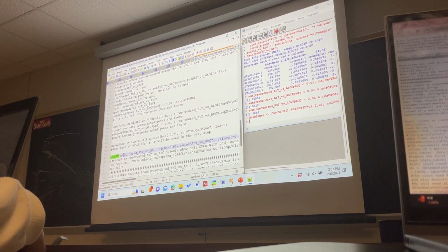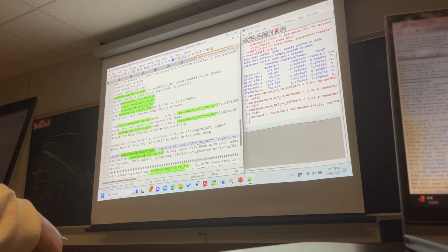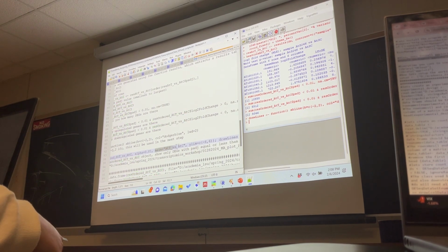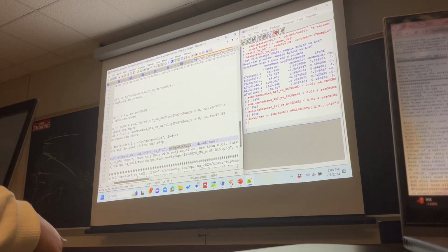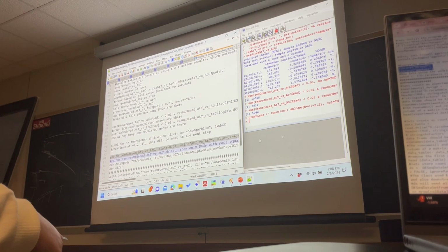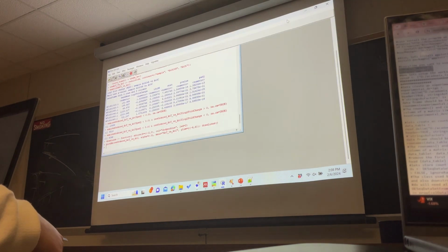It comes with DESeq2 itself. So you just use that plotMA function and visualize the object that you created earlier with some alpha value for the dots, then write the title for this figure, give the y-axis minimum and maximum values of -6 and +6, and then draw the line. This draw line object was created earlier here. So you can just plot it here and see if it created anything.